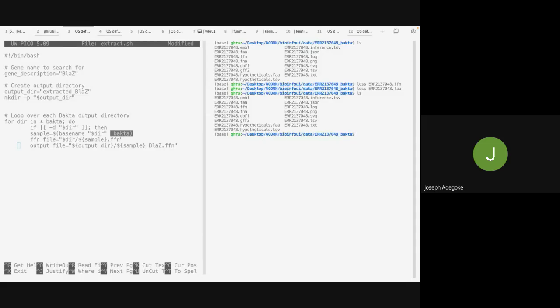Once you send your script there, it's like, where am I going? So the next thing is we need to point it to the file where we want it to go. To bring it to the file, we are going to name it as a variable, which is ffn underscore file. And remember the directory that we've made as a variable, that's variable one.